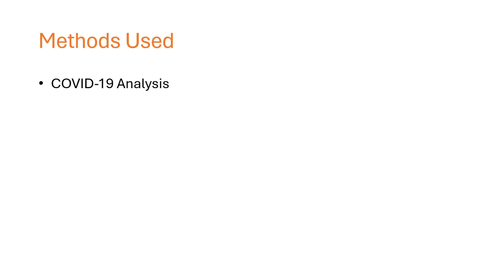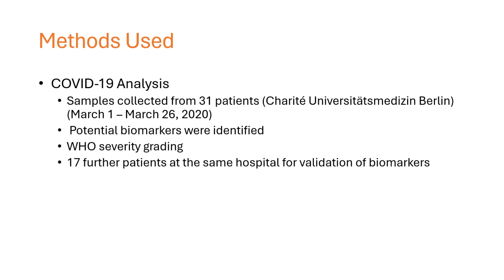The authors then turned their attention to COVID-19. They wanted to use their platform to analyze patients that had been hospitalized with COVID-19. Samples were collected from 31 patients in the hospital in Berlin between March 1st and March 26th.